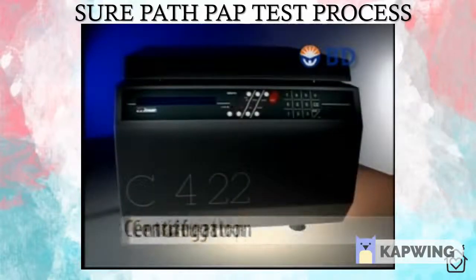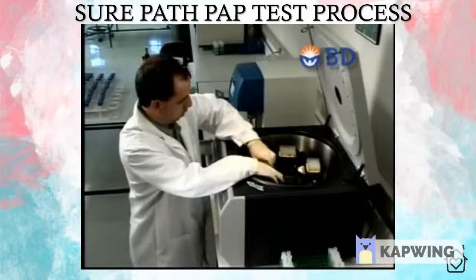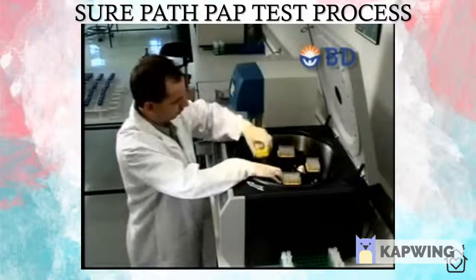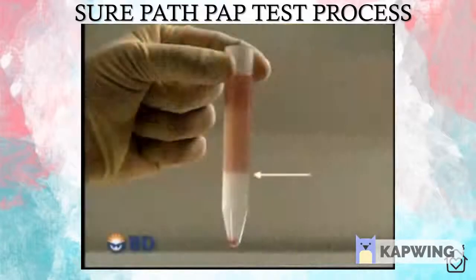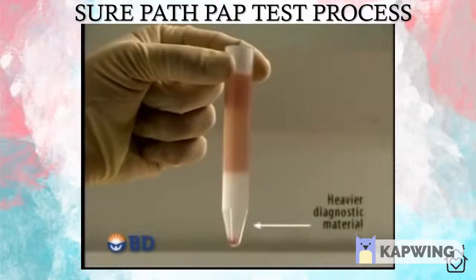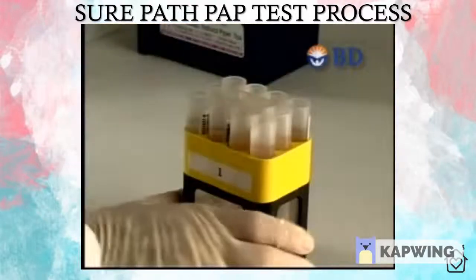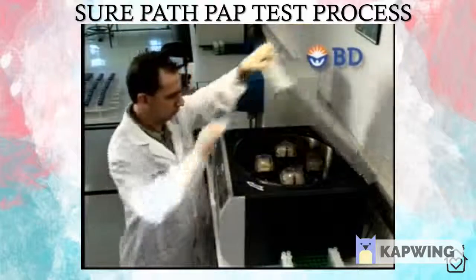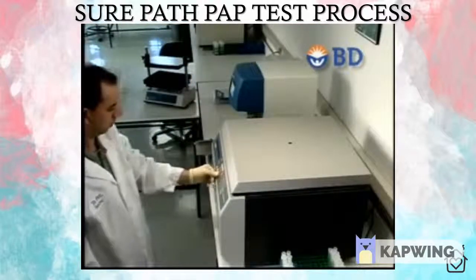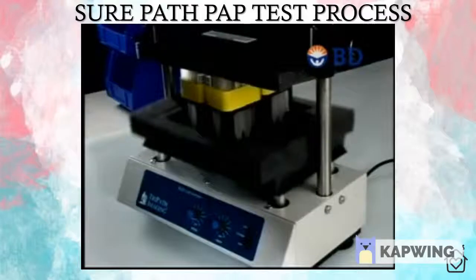A pre-programmed centrifuge is provided with the PrepStain system and can be used for both gynecological and non-gynecological applications. With SurePath slides, there are two centrifuge cycles. The first, a soft spin, takes a little over two minutes. In this cycle, the density reagent sorts particles based on size, shape, and density. Heavier diagnostic material passes through the gradient, settling to the bottom, while lighter red blood cells, mucus, and approximately 50% of inflammatory cells remain trapped above. Once the soft spin is complete, the supernatant fluid containing the obscuring materials is removed. Then a 10-minute hard spin occurs and excess fluid is removed, leaving an enriched cell pellet. The samples are then vortexed and are ready for the PrepStain slide processor.